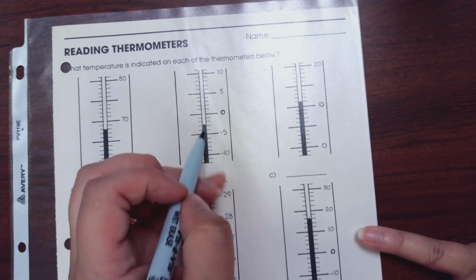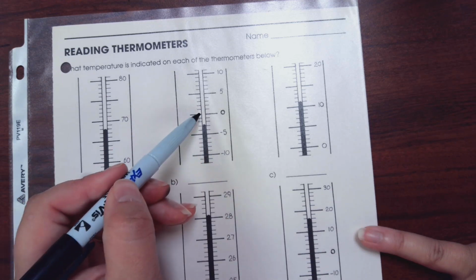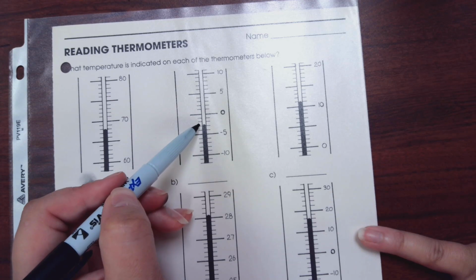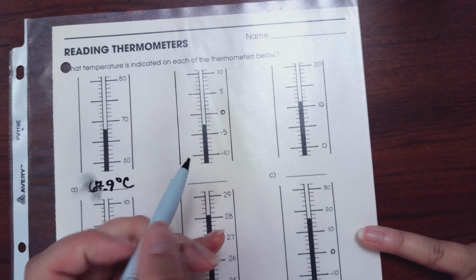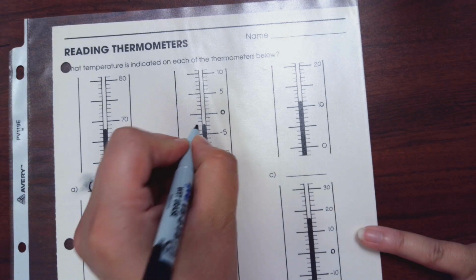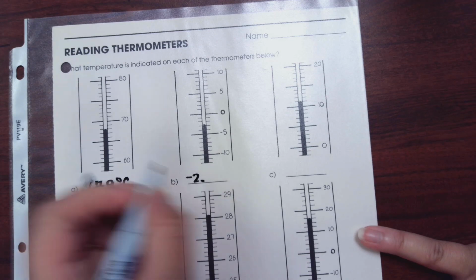On this thermometer, we're in the negatives. So remember, these numbers are kind of going backwards. So this is 0, this is -5, so this is -1, -2, -3, -4, and -5. So we are at least at -2, but not quite to -3. So I'm going to put this as -2 point.